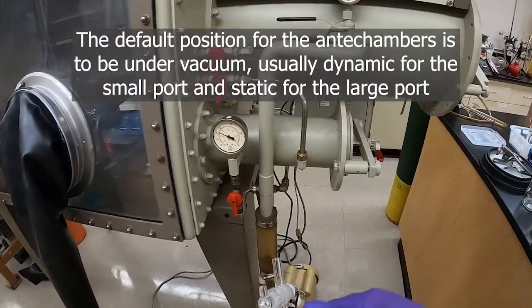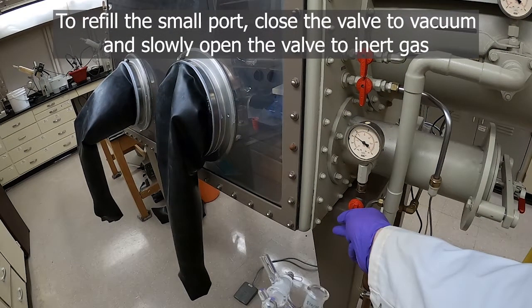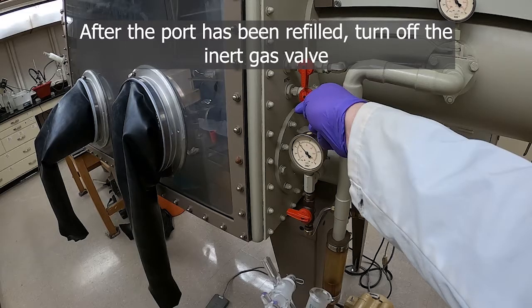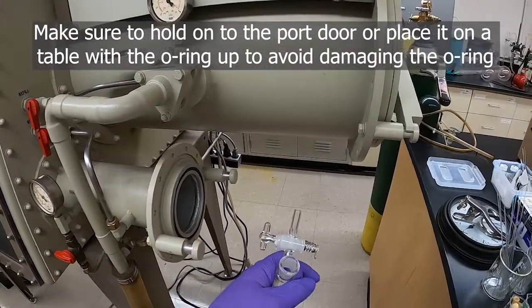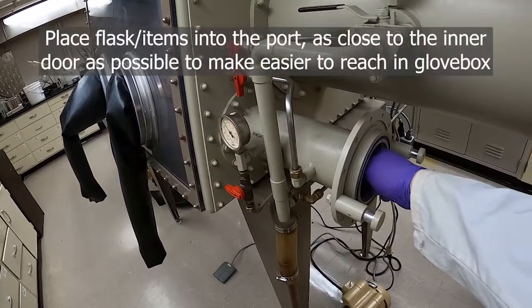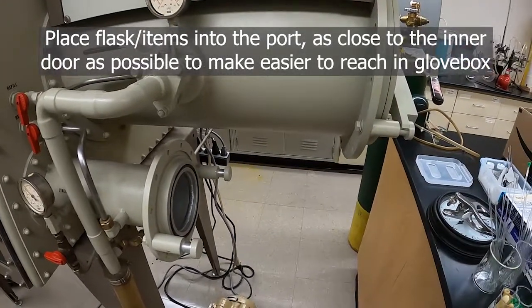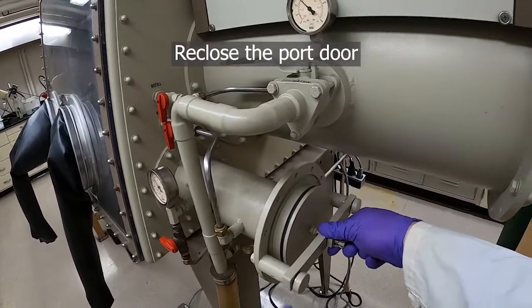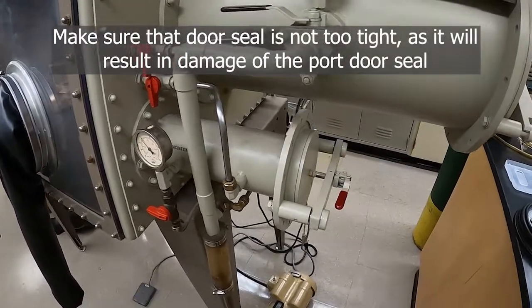If the default position of the port is under vacuum, we'll need to refill before we start. Hit the refill, then we can open the port and place our flask and the items we want to bring into the box. It's easiest if you put them on a metal tray and push them as far in as possible, closest to the other door — this makes retrieving them on the inside much easier. Close the port; you don't need to close it too tightly as you don't want to damage the seal.